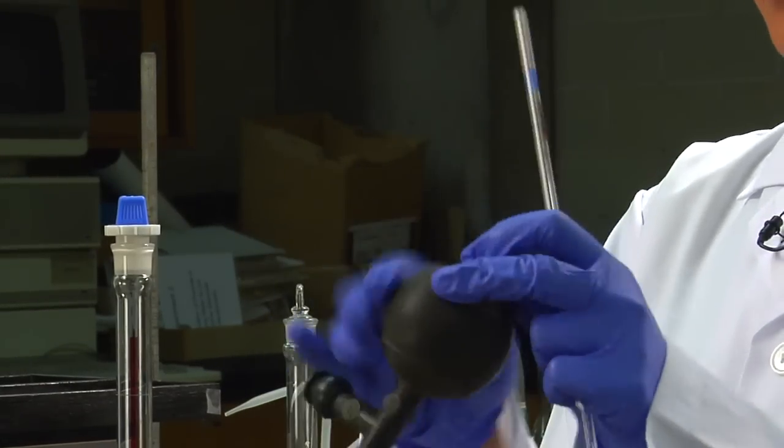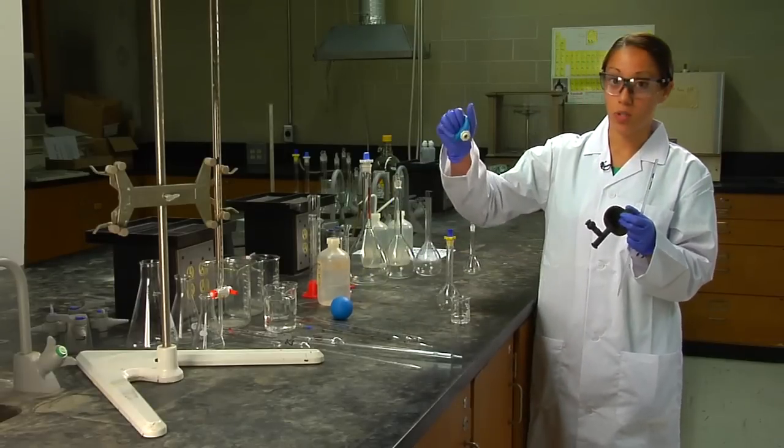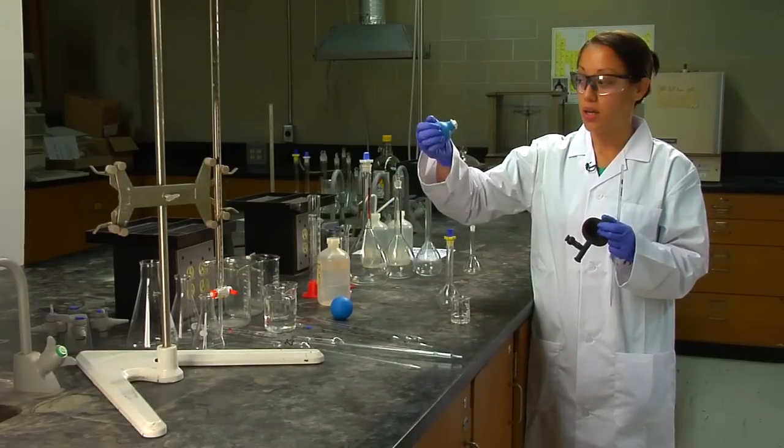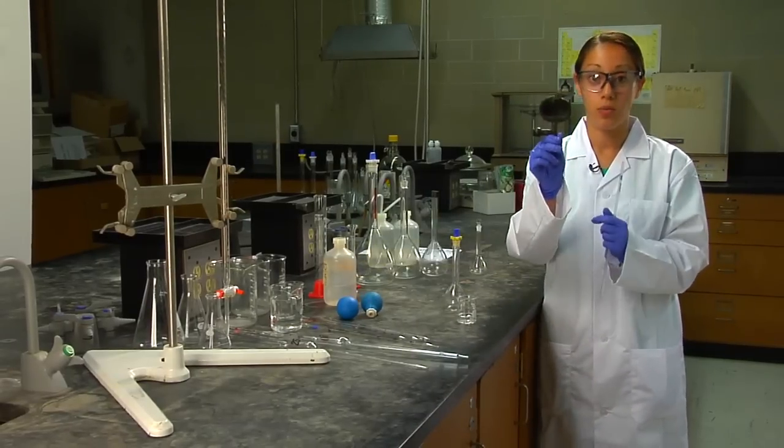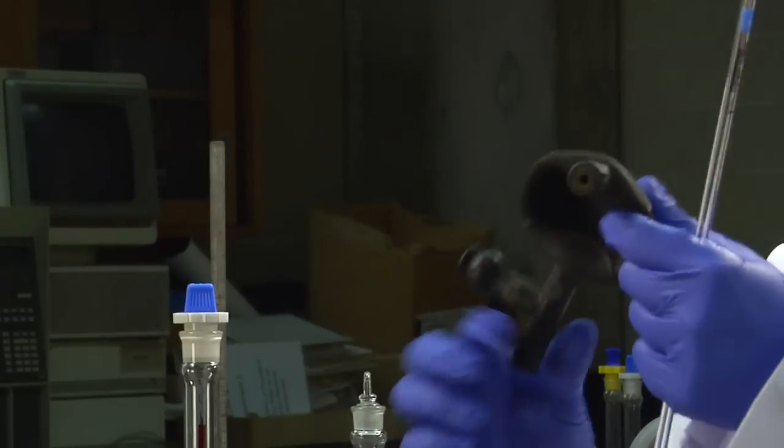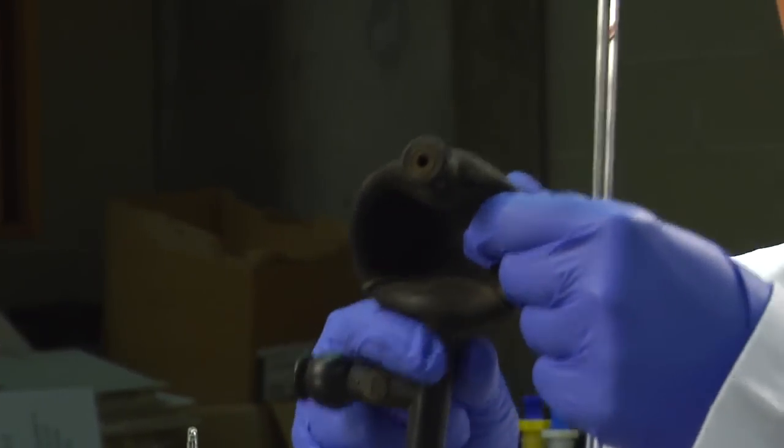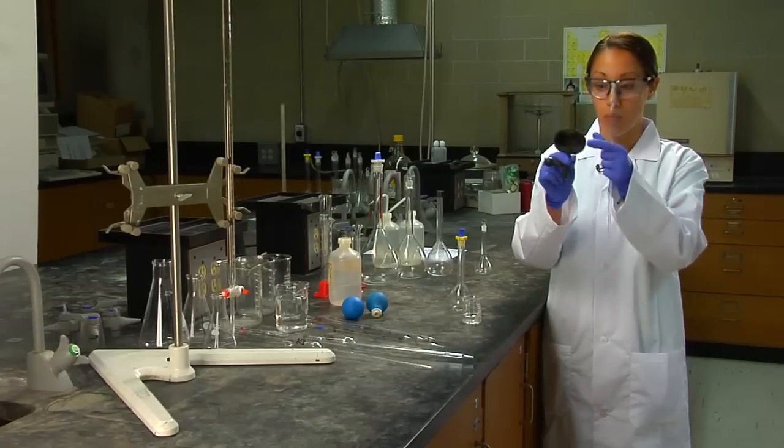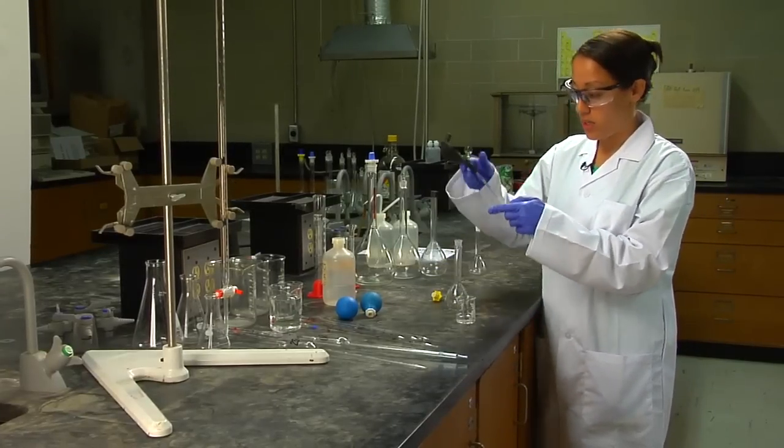A is for reducing the air pressure in the bulb. Much like these, I'm sure you've experienced, it's hard to keep the air pressure reduced on your own. This little seal helps you achieve that, and then there's two points here. S to connect suction from your pipette to the air bulb and then E for empty. This makes life much easier when making your standards.